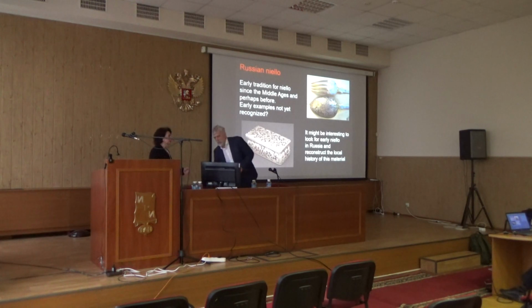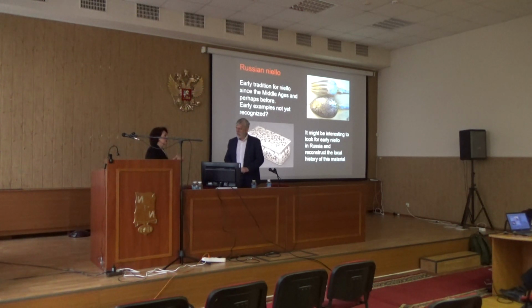Oh, well, normally people call me and they find the lab if it is necessary. I do have my equipment, as you have seen. So, you know, it depends on what the question is, which kind of material. For example, I'm working now with the University of Munich in Pompeii, in Naples, at the National Archaeological Museum of Naples. So I brought my equipment, and I also take samples to have atomic absorption and ICP analysis done in Munich.